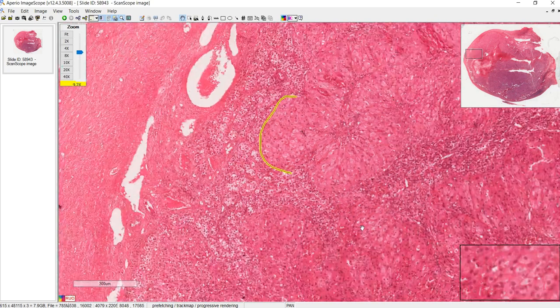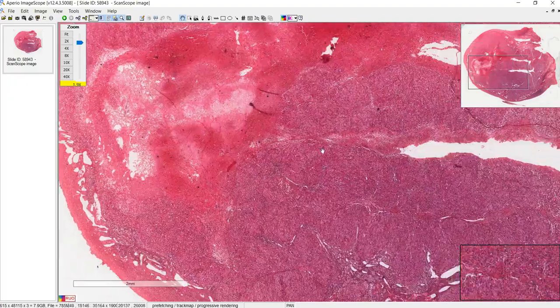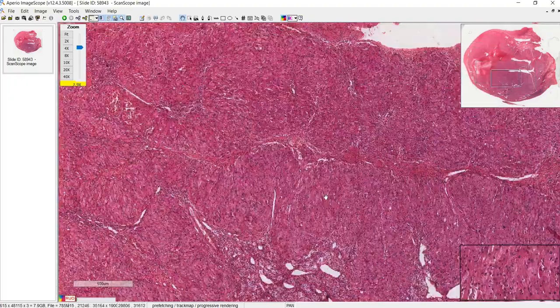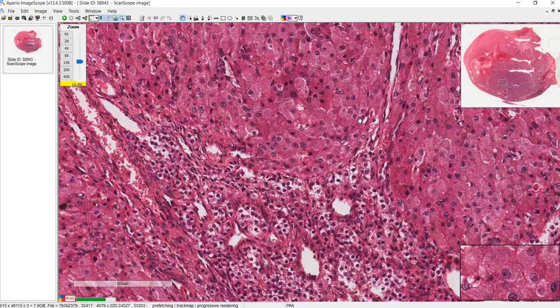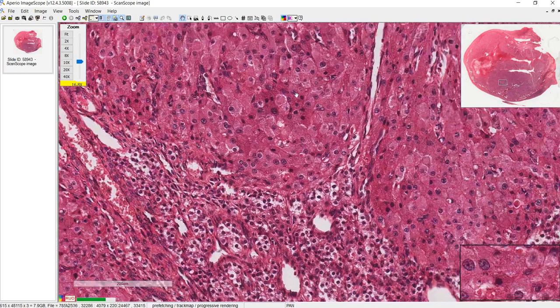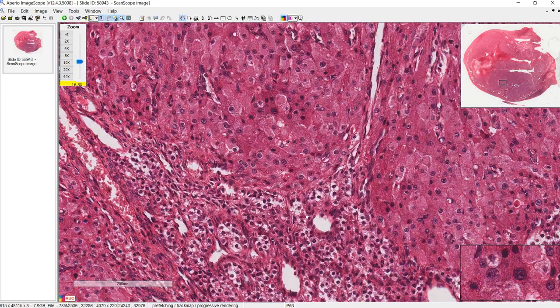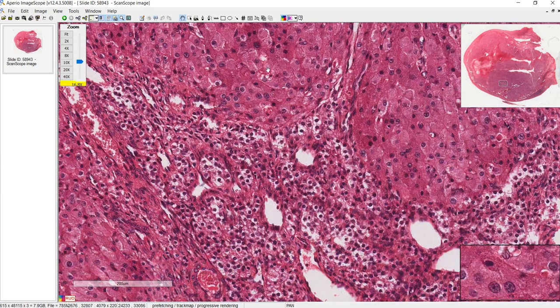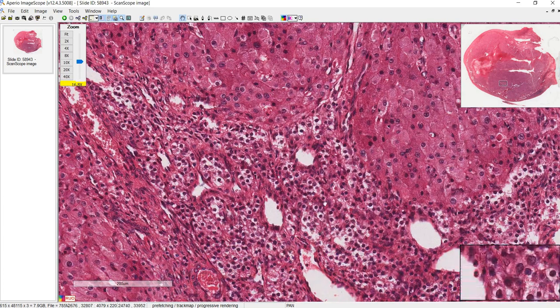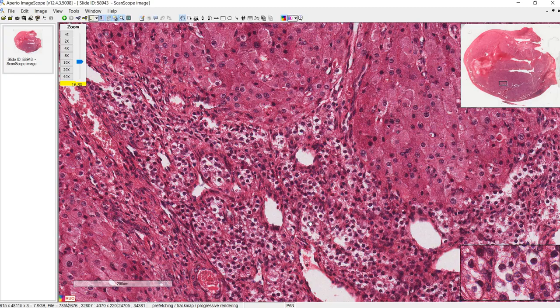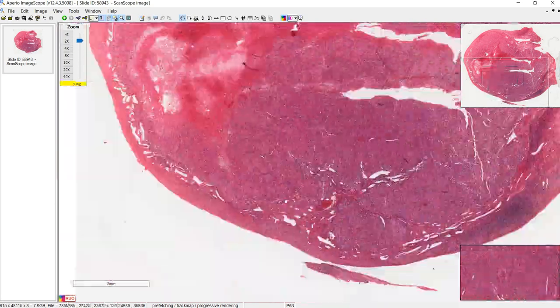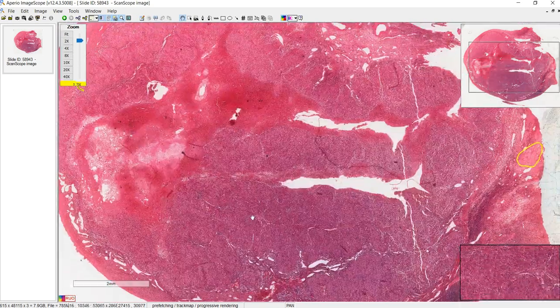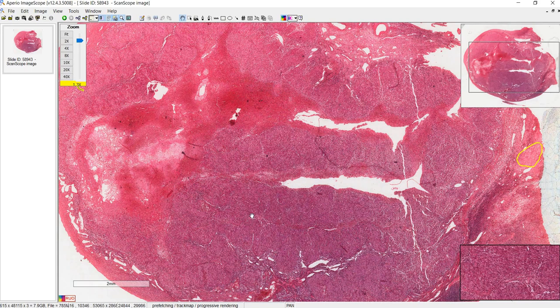Looking at a different part of the slide, you can still see the difference between the granulosa luteum cells up here and the theca luteum cells down here. At this stage, the corpus luteum is producing progesterone, and that's it for the ovary.